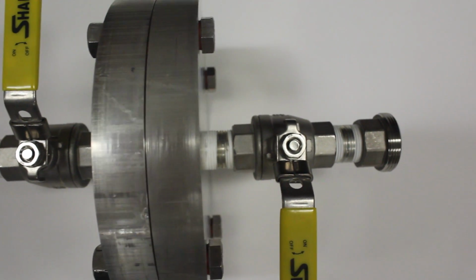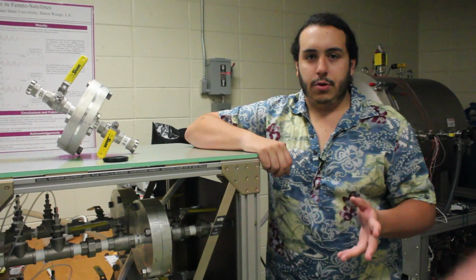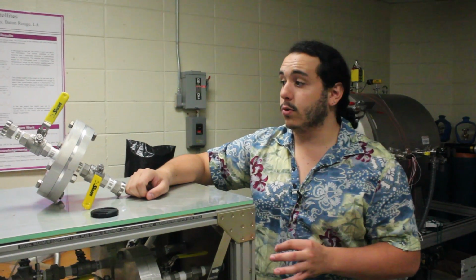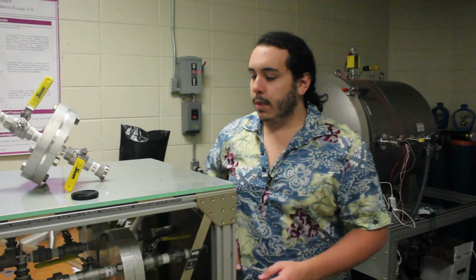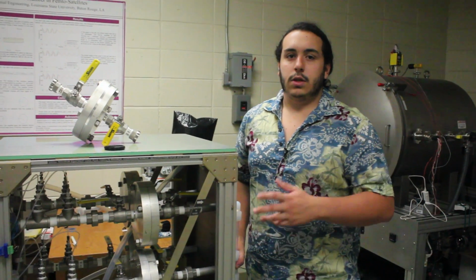The filters themselves are a PTFE membrane, and the membrane is a thin, papery substance with 0.45 micron sized holes to allow the air to pass through, but not the microbes themselves. On our system here, we have 6 of these filter housings. There's one for each altitude that we're going to be collecting air samples, which is 5 distinct altitudes, and then there's one which is a control filter. This one will never be opened up to see any flow, and so it's going to serve as our baseline for biological analysis.